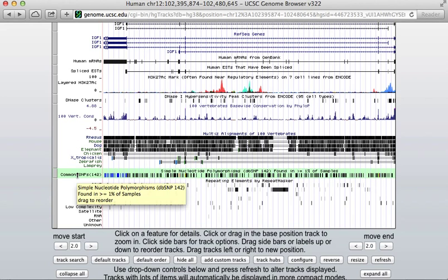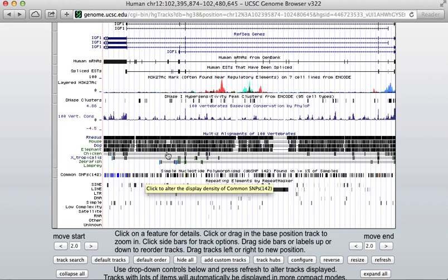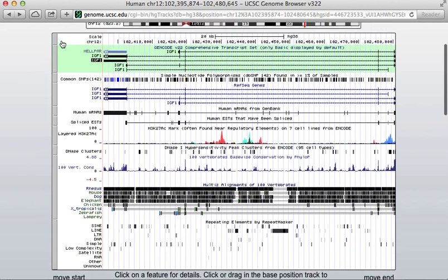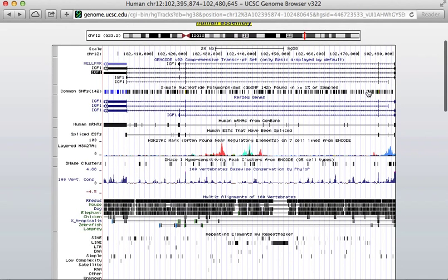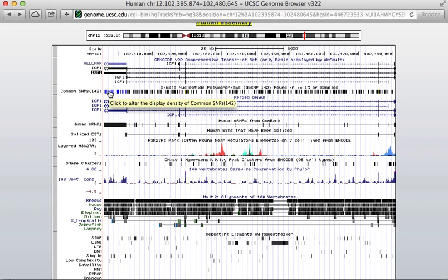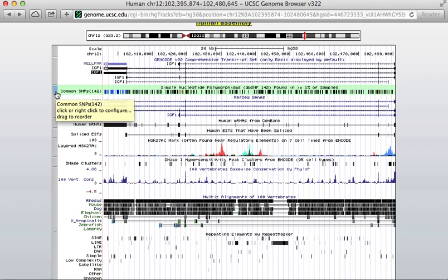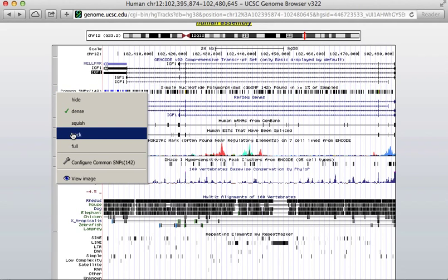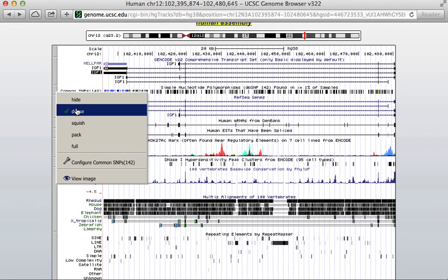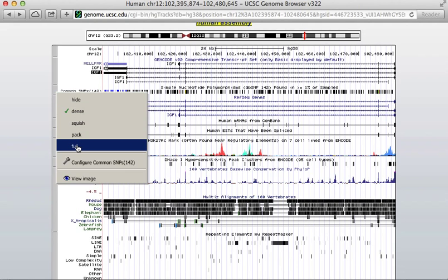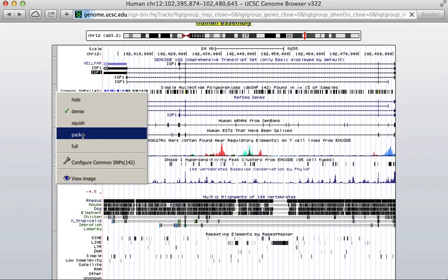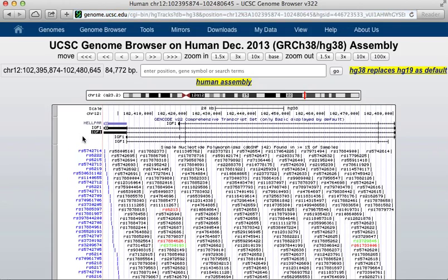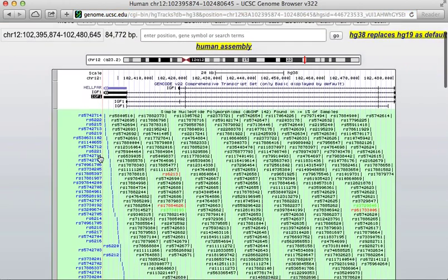Let's say I want to look at the SNPs in this gene. Right now the SNPs track is sort of far away from where the exons are. I can just click it and move it up — drag it up — so that I can see how it overlays more closely. Right now it's in a very dense view, so I can't see individual SNPs. But I can hold down the control key and click on this left-hand bar, and I can expand it to the pack view. This goes from invisible to very dense to very lots of information, and now I can see each individual SNP.